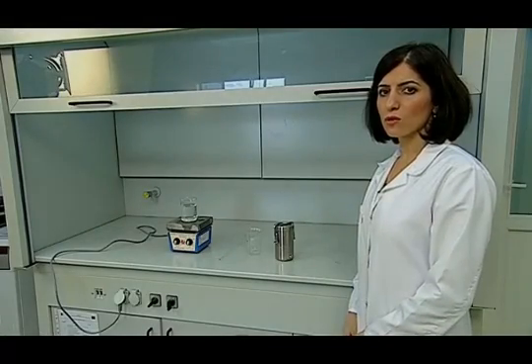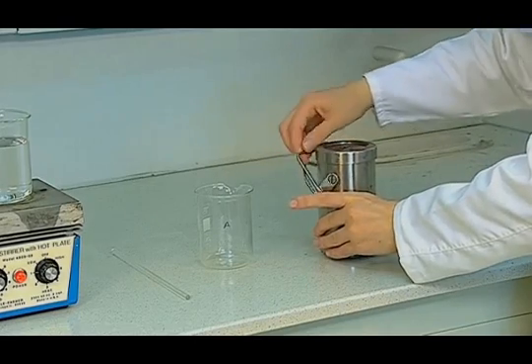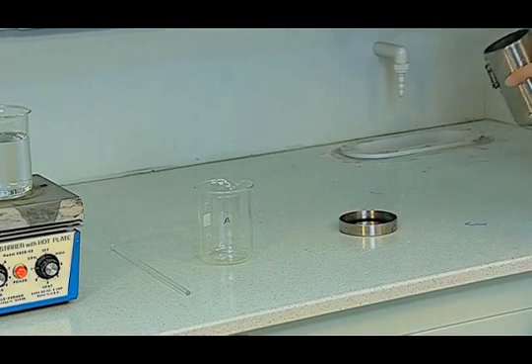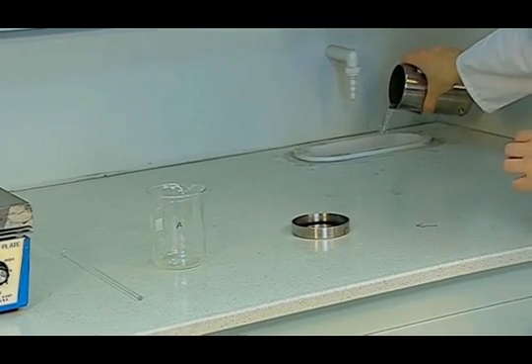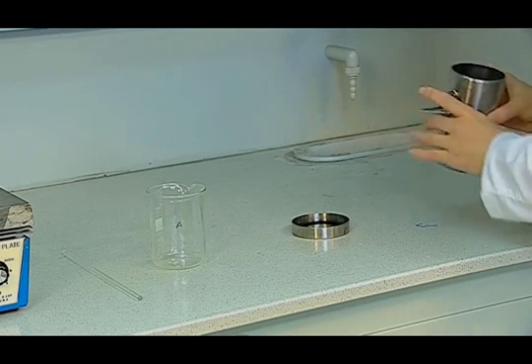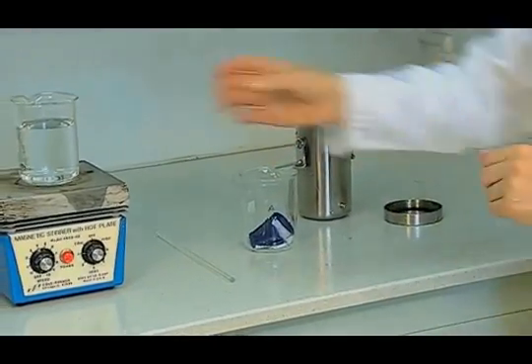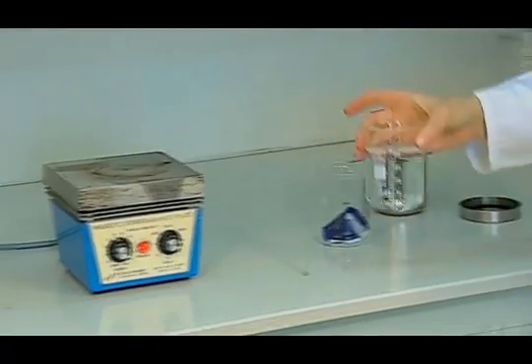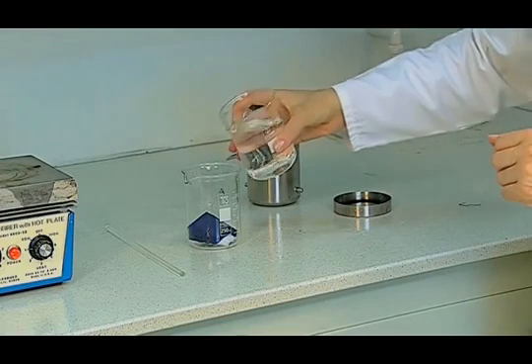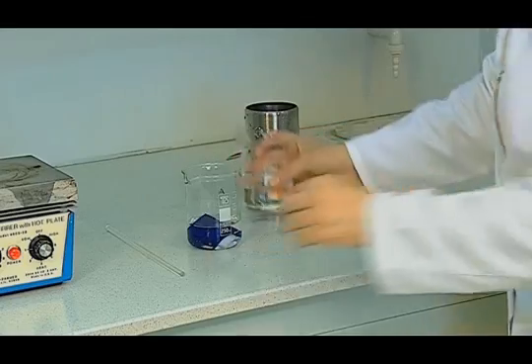The washing fastness sample is removed from the container. Then, the excess water is discharged. It is put in the beaker to wash off. Pure water heated to 40 degrees centigrade is used to wash off the sample with 100 millilitres of pure water at 1 minute intervals.